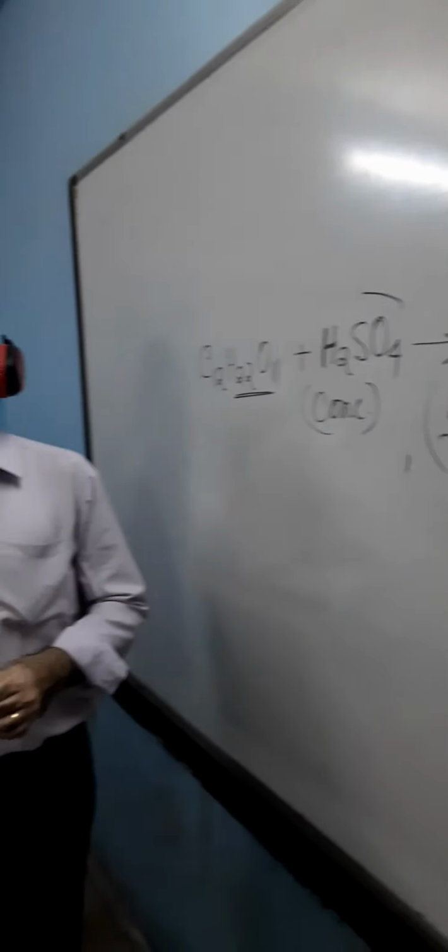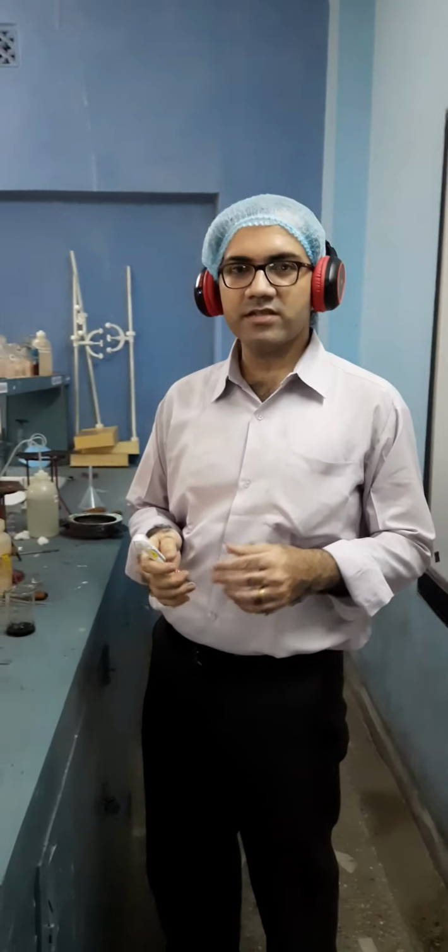So I hope you have liked this reaction. It's a chemical change which has taken place. We have already discussed physical change and chemical change. So this is a chemical change.